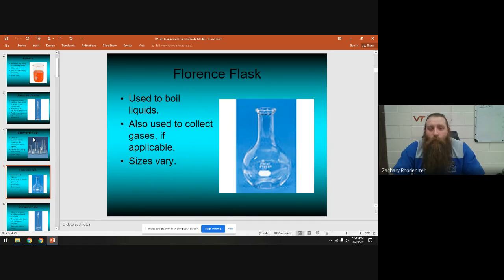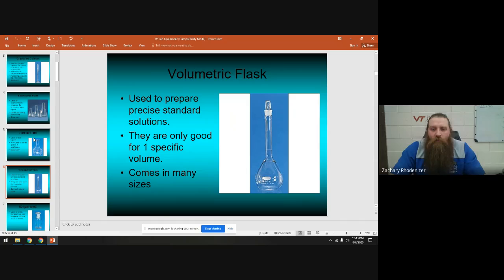A Florence flask is also called a round bottom flask. It's good for boiling, and sometimes used in organic chemistry to collect gas. A volumetric flask looks similar but has a single extremely accurate line on it. A volumetric flask only measures one volume — for example, exactly 50 milliliters — so it's good for measuring out specific aliquots but not for experiments where you don't know how much you'll have.